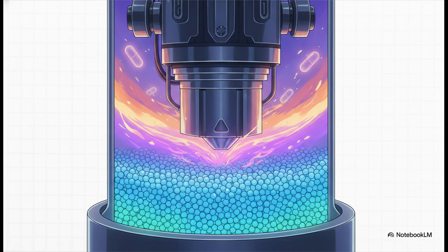And you see this principle perfectly demonstrated in one of the most common and vital techniques we use today: high-performance liquid chromatography, or HPLC for short. In modern HPLC, that stationary phase is packed into a column using extremely fine particles, usually just between 2 and 5 micrometers. Because these particles are so incredibly tiny, we're talking a fraction of the width of a single human hair here, liquid isn't just going to flow through them naturally.